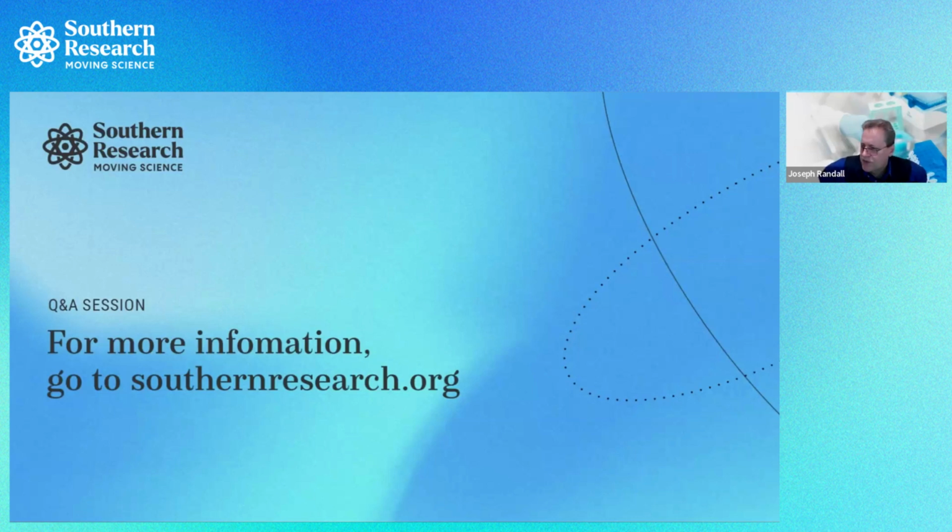So one of the questions was, what was the age of the monkeys used in the monkey neurovirulence test here and in the published study? I can just say that we used 2-year-old monkeys in general, and they were about 2 to 3 kilos. Unfortunately, it's so hard to get animals these days that they're getting younger and younger. So we usually prefer to have 2 to 3-year-old monkeys or 2 to 4-year-old monkeys. They're more mature, but they're harder to get these days.